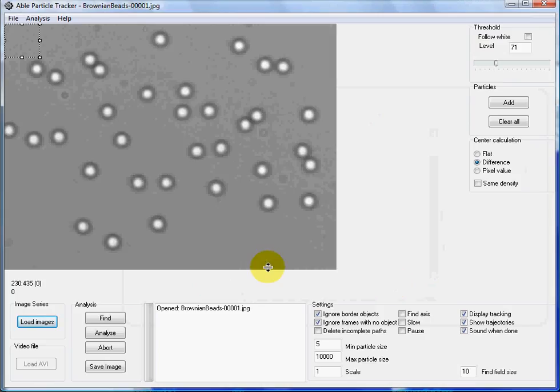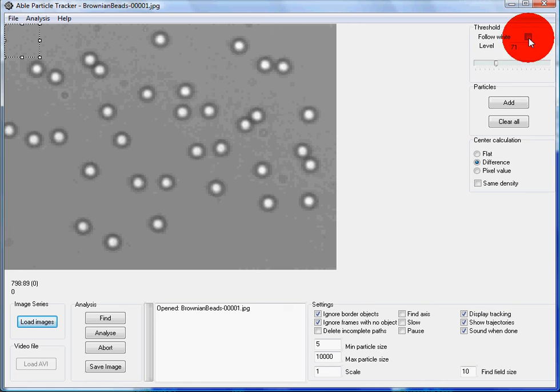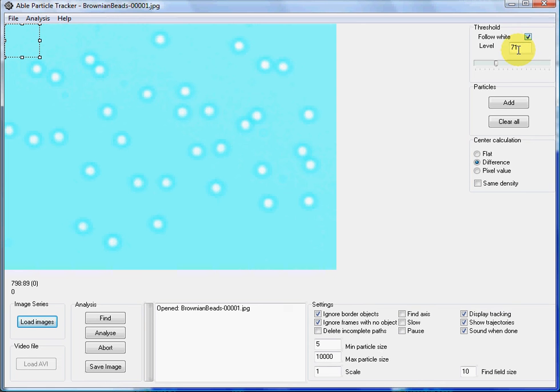As you can see we have bright particles on a darker background. We have to select proper threshold level and since we are following bright particles this has to be checked.